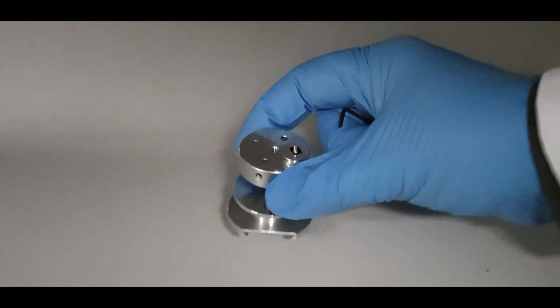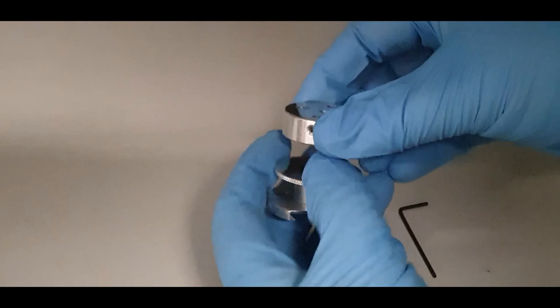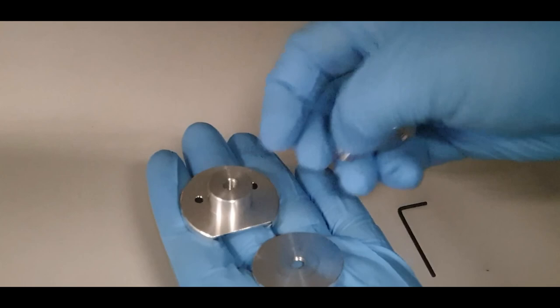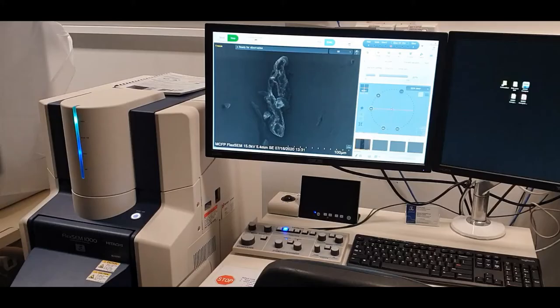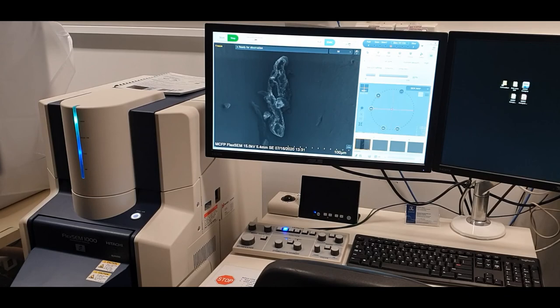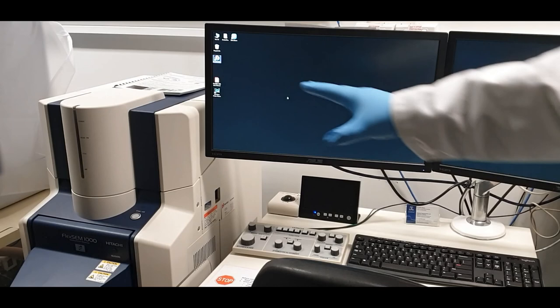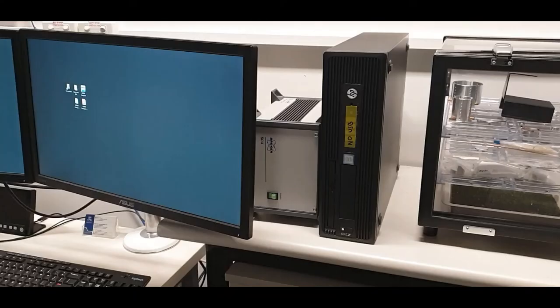Make sure to remove your samples from the holder — use the allen key to unlock the grub screw, remove the pin stub, and then disassemble the stage. Return everything you have used back to the SEM cabinet. Once the instrument is pumped down and the evac light is solid, close the software and then power off the instrument. Powering off while pumped down means the instrument stays under vacuum, keeping it far more clean for the next user. If you've used the EDX, ensure that you also power off the Brooker controller.